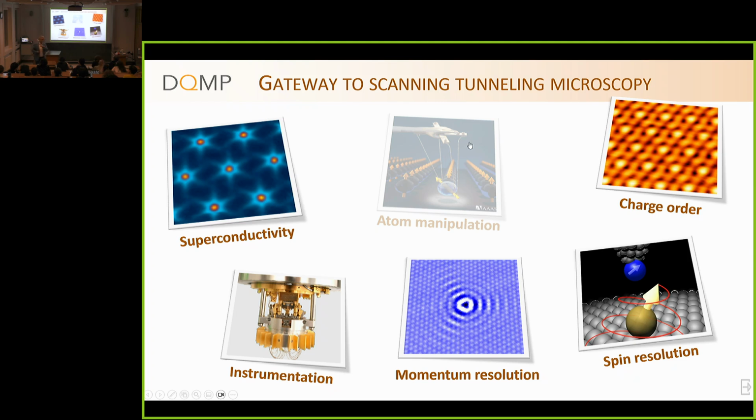And actually, that's a side remark. Eliot showed you the scanning, where you go forward and backward and you draw the lines. That doesn't work. The lines will not be the same. So you have to take an image always in the same direction because of the hysteresis loop. These are certainly complications. But as I said, this is a commercial company working on atomic scale lithography, and they start to have commercial products. So it can be done. I'm sure it can be done, but I cannot imagine how they do this. Apart from the hysteresis, these piezos are pretty reliable. That was actually another surprise, that they have a continuous response down to picometers, definitely.